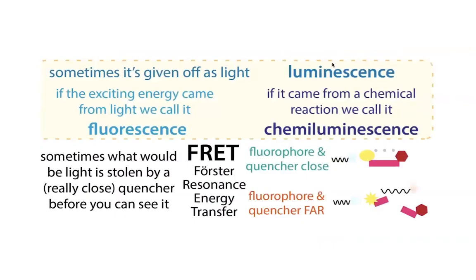Some of these include things like FRET and BRET. We talked a little bit about fluorescence. So there's also this thing called FRET, or Förster resonance energy transfer. You might also see it called fluorescence resonance energy transfer.